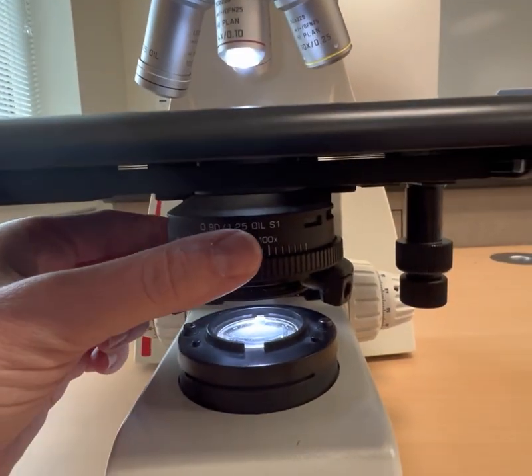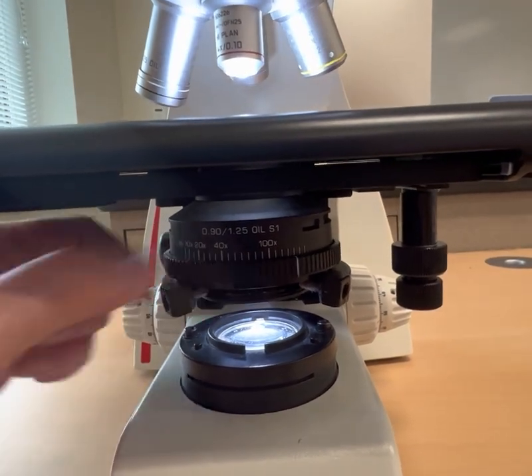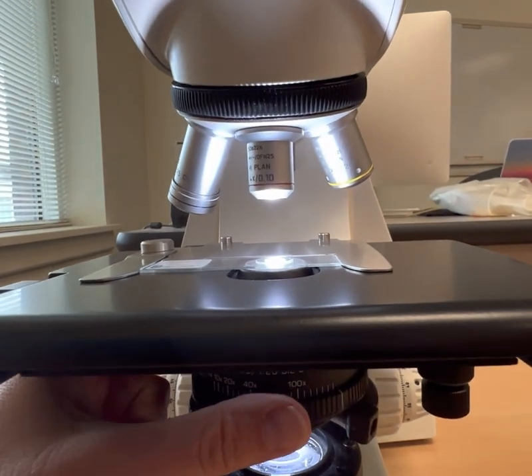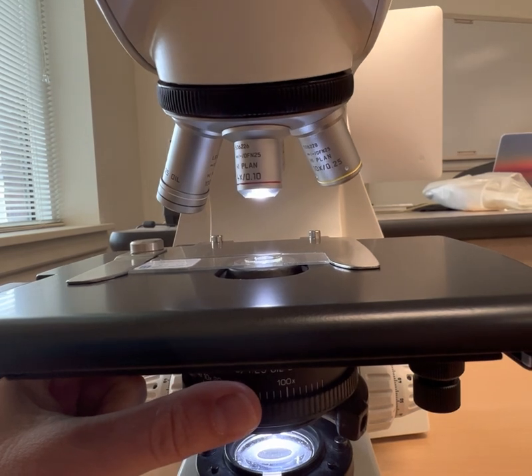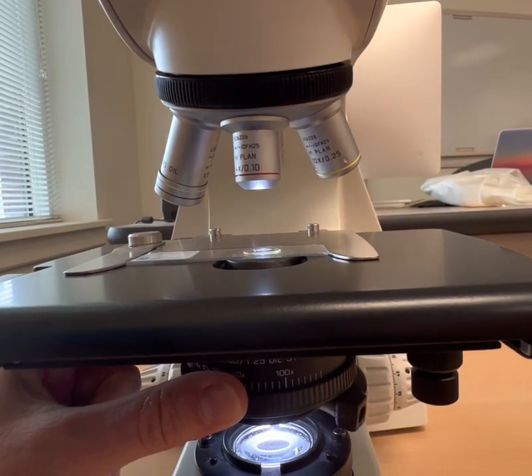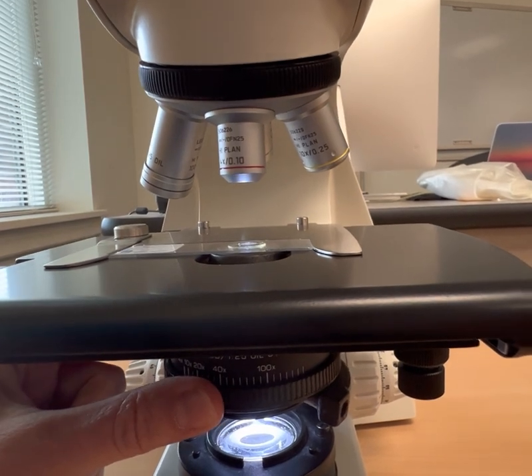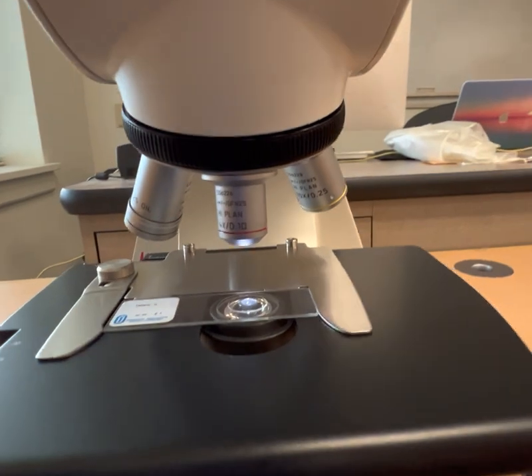So check out, this is the iris diaphragm. And what it does is it controls the beam of light that comes from the light source. So watch up above, I have a very broad beam of light. And then as I change the diaphragm, it's going to make a very narrow beam of light. So this too is another thing that you can play around with when you're looking at your slide images and trying to get the best view.